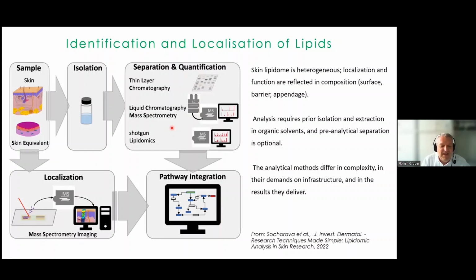Most analyses are done on lipids that are extracted from skin or from skin cells. And there, a great challenge is always to acknowledge that the skin is a heterogeneous organ and tissue, and that there are differentiation-dependent dynamics in the sample that you will be able to take from this organ. This has to be remembered when performing the analysis.